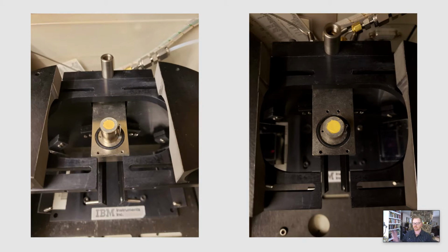And of course, it's being exposed to light. Right after this picture was taken, they got the experiment going through the kinetics. But you can see it's a powder solid. It's loaded right in there. And the way these elliptical mirrors work, you can see there's a groove right there. Those elliptical mirrors are going to close over the sample to complete the optical pathway.